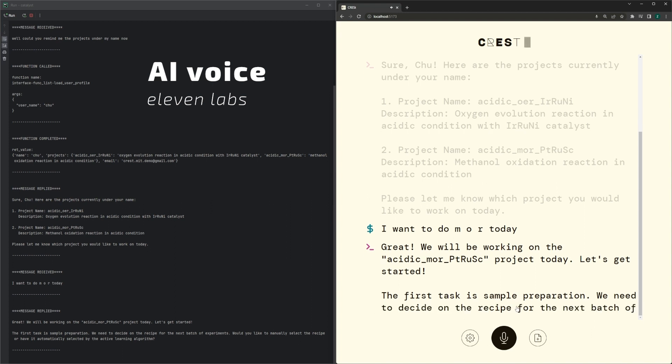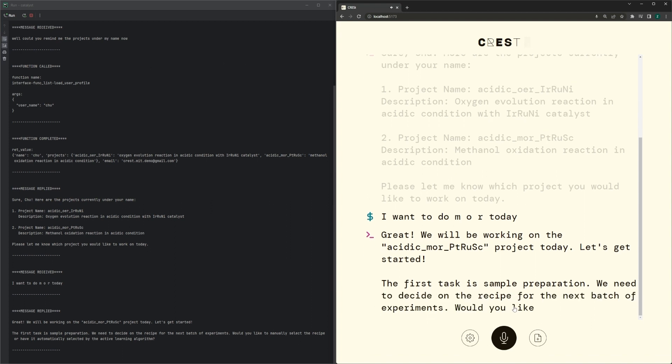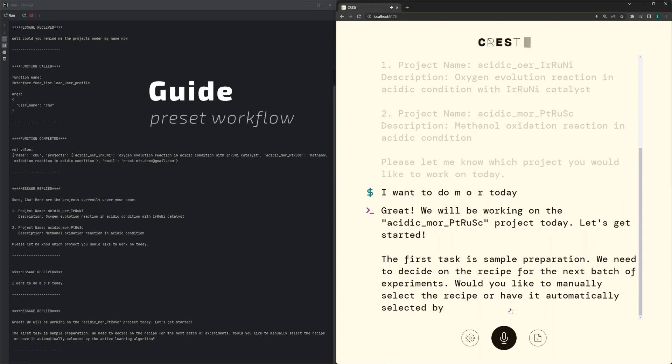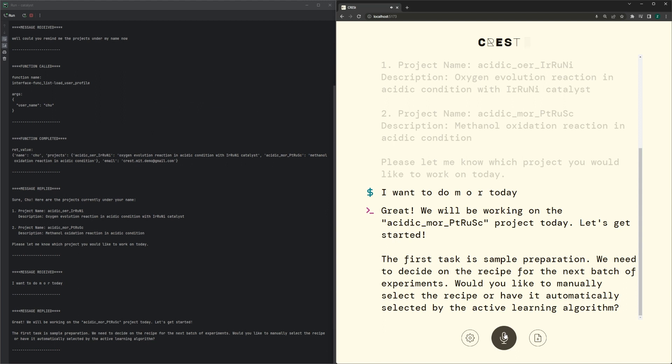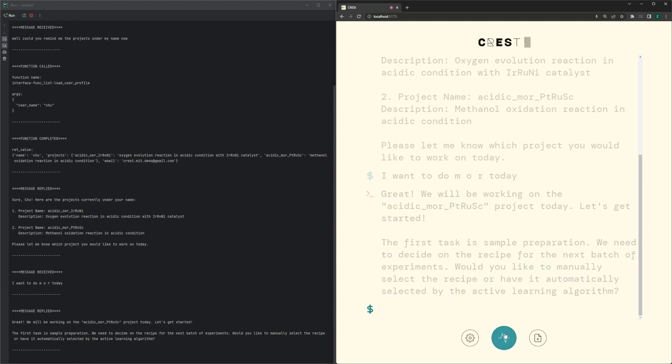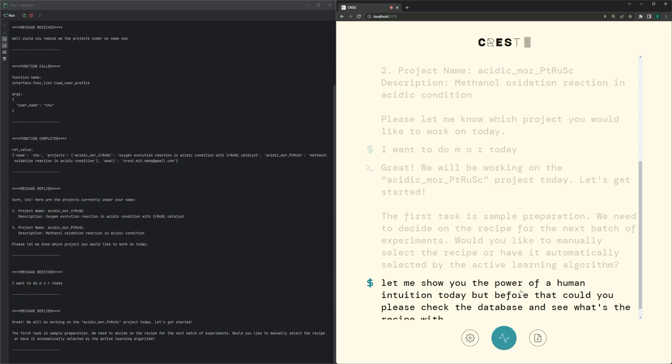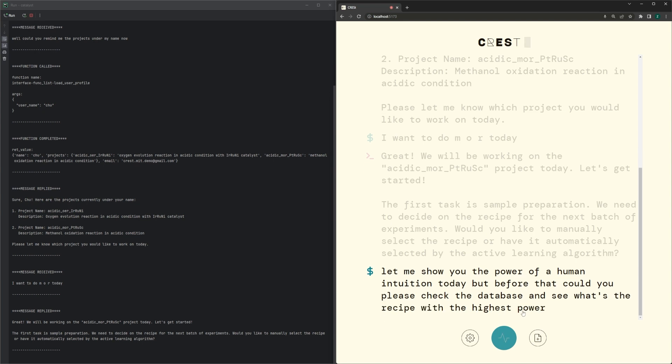The first task is sample preparation. We need to decide on the recipe for the next batch of experiments. Would you like to manually select the recipe or have it automatically selected by the active learning algorithm? Let me show you the power of human intuition today. But before that, could you please check the database and see what's the recipe with the highest power so far?